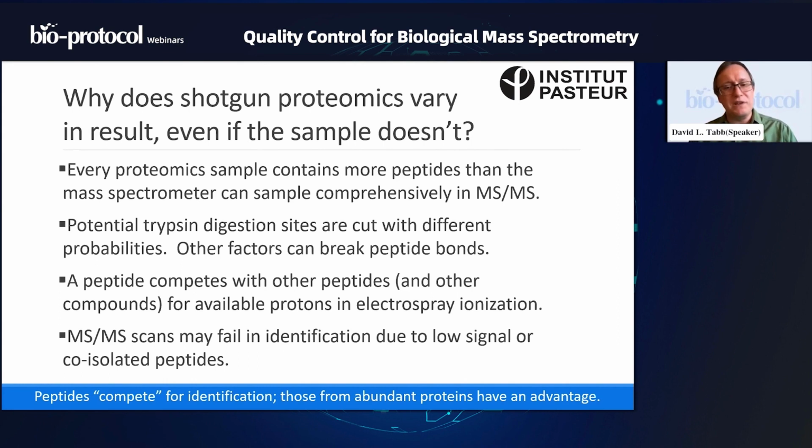Yes, even if you're working with a sample that's just 100 proteins, which peptides are visible to a particular experiment will differ from run to run. If you run that same sample 100 times, each of those 100 runs is going to get a different set of peptides than did any other. It's shocking when people aren't familiar with this technology to realize just how much these data can differ on a peptide level or on a spectrum level.